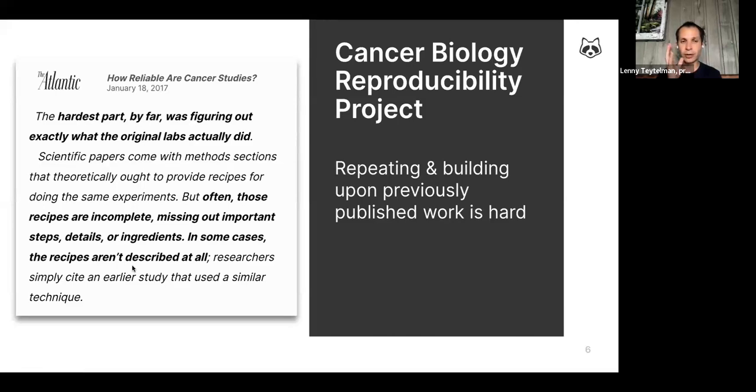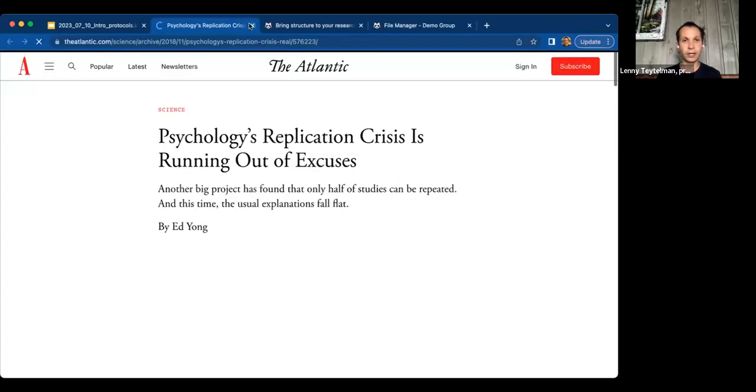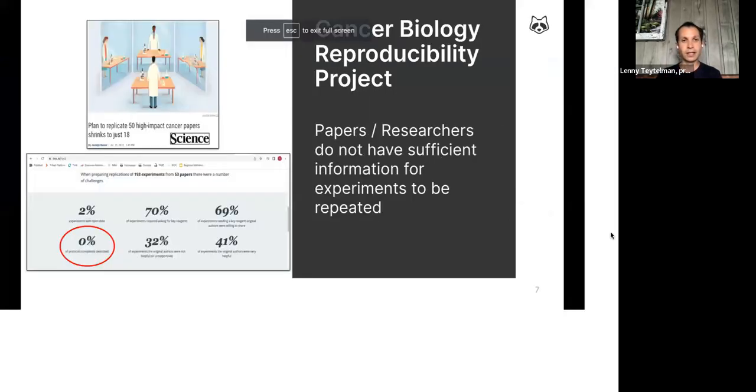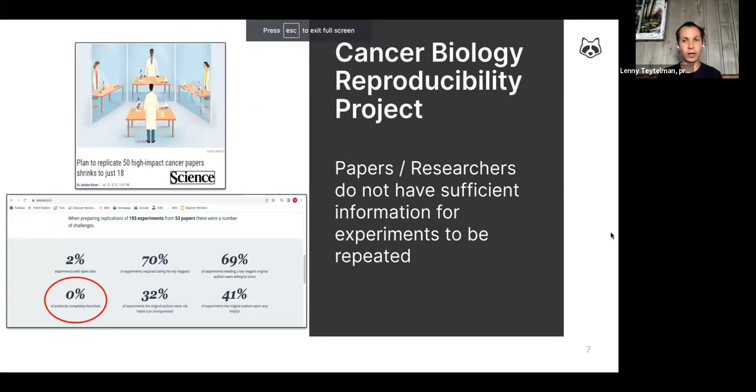So it's not just about the published paper, but it's hard. I didn't want to open the article. I wanted to advance. It's hard, even when you're collaborating with the authors that did the work, to find those protocols. Again, because people move on, people forget where they wrote it down. They have 10 different versions of the protocol corresponding to a result, and they're not sure which one exactly it is.